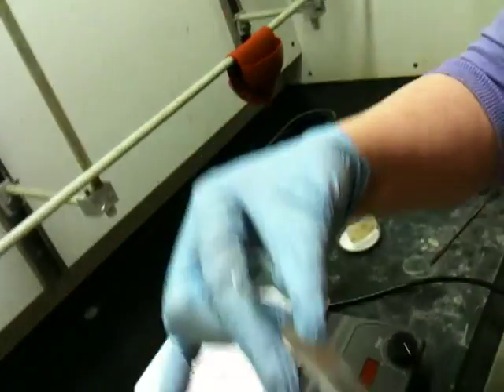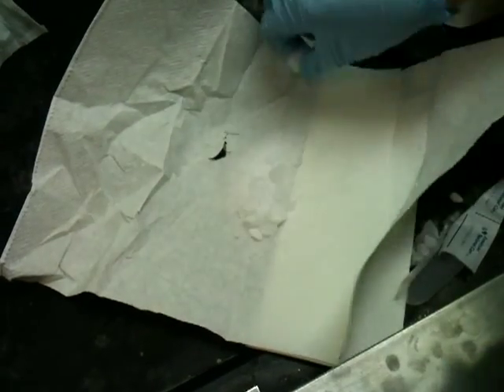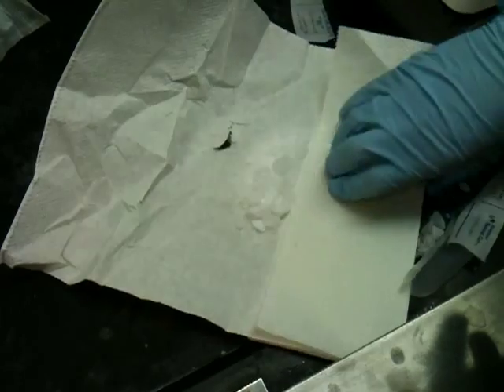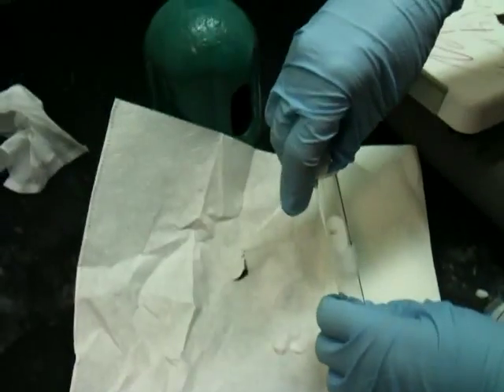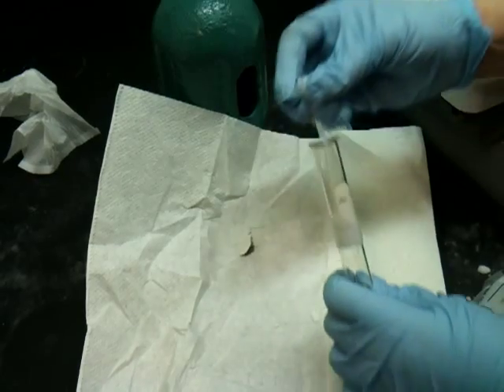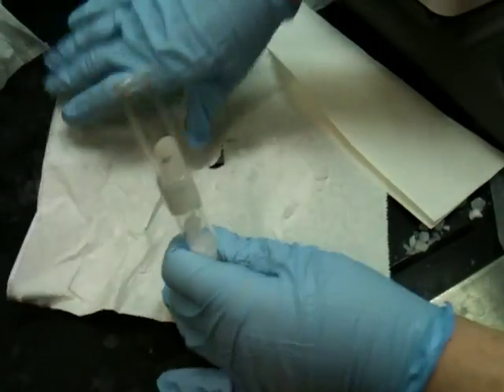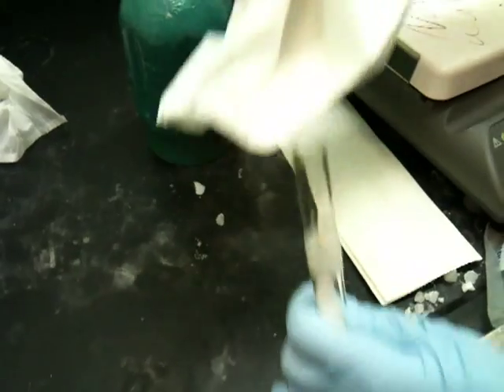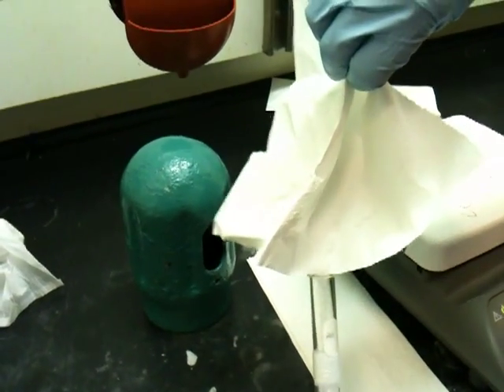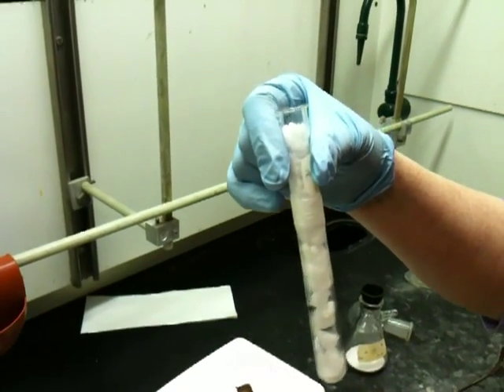Once this is done, you can put this dry ice into your test tube. You could do it manually, or you could pick up the paper and kind of shoot it in, which is probably what I would recommend. You could take your paper towel and use it like a little chute to put the dry ice into the tube. Now the tube is pretty full of dry ice, and it's going to act as a surface on which the compound can deposit.